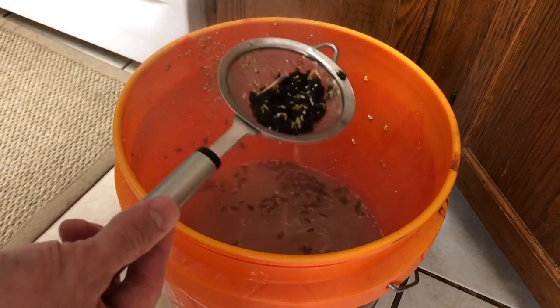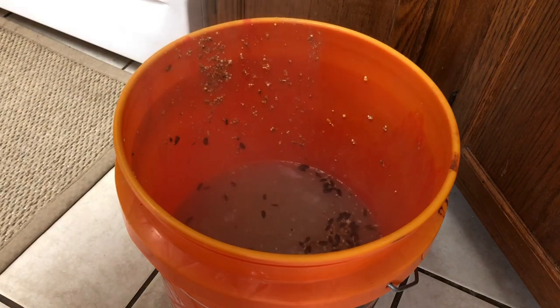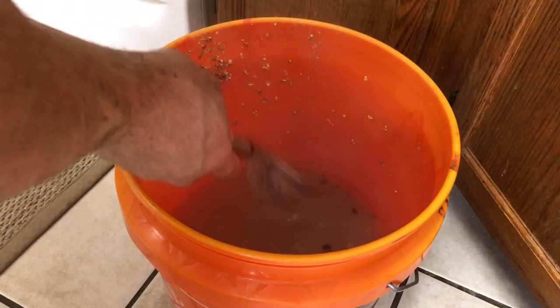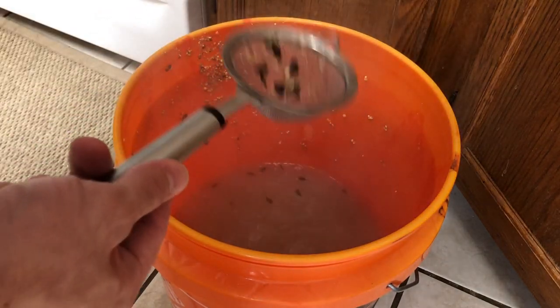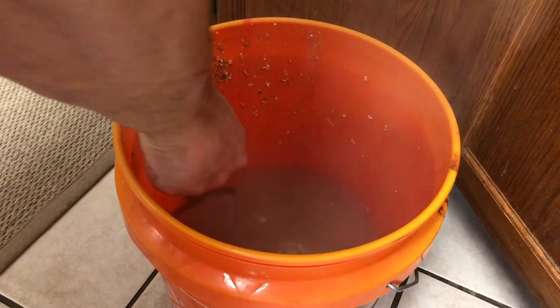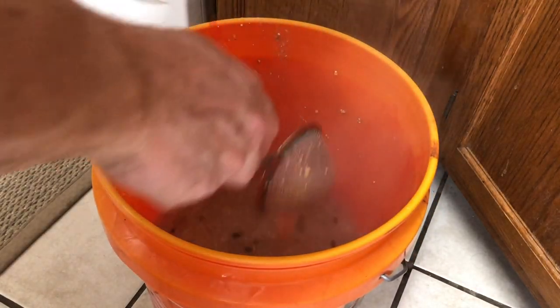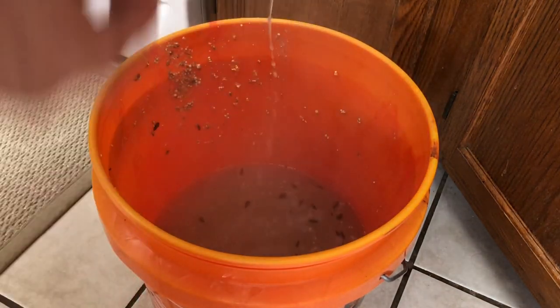Just kind of waste having it in there. And the goal is to get your jars to colonize as quickly as possible. So wild bird seed, while it may not be the best grain, it's a constant debate, but it does work very well. It's very easy to get it perfectly sterile so that you don't have to worry about contamination in your mono tubs or your shoe boxes or whatever you're doing. So you can see that took me not even 45 seconds. I want to give it a stir, and a couple more will come to the surface. Then you just do the same thing and grab those.